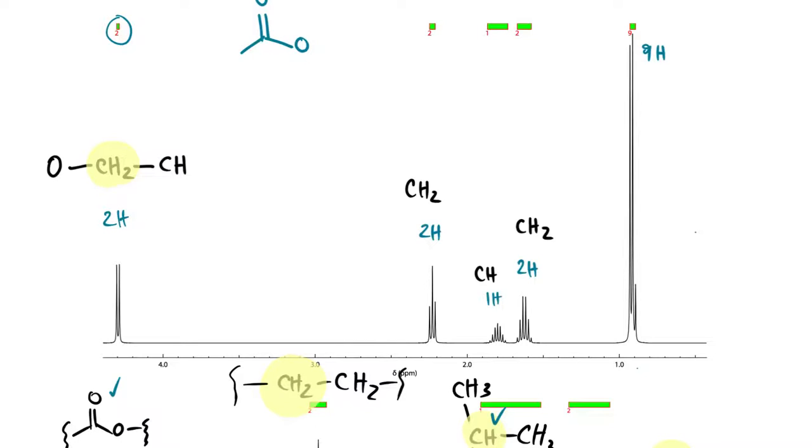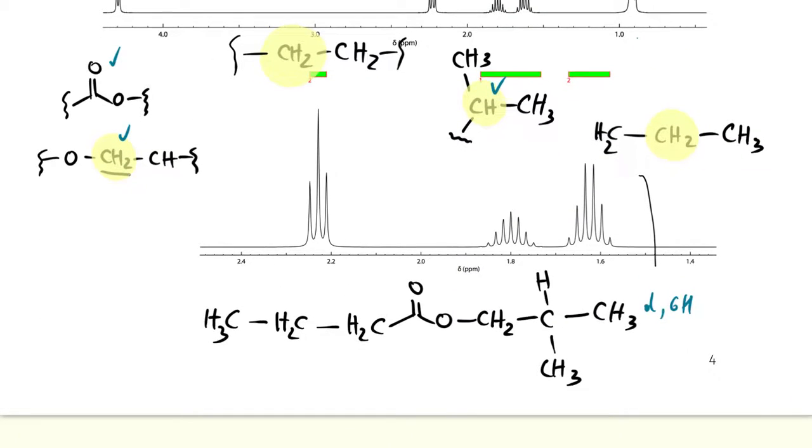So let me go back and try to explain why we should see 9 lines for this guy, but we only see 7. I didn't anticipate that. I should have zoomed this graphic up even more when I produced it. If you look closer, there are teeny tiny lines on the periphery. You see that? And that's actually from 7 becoming 9 lines.